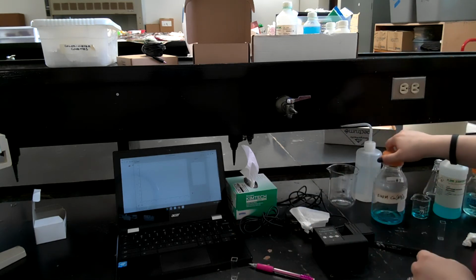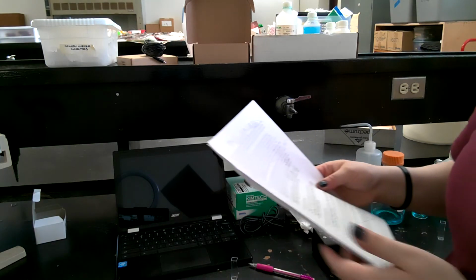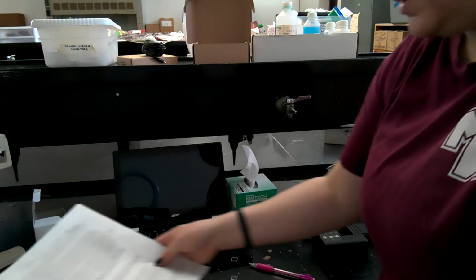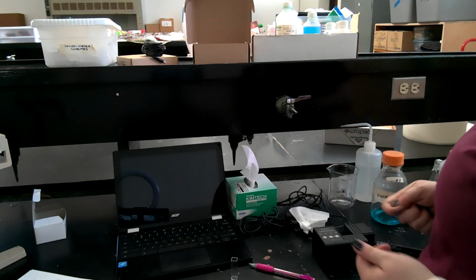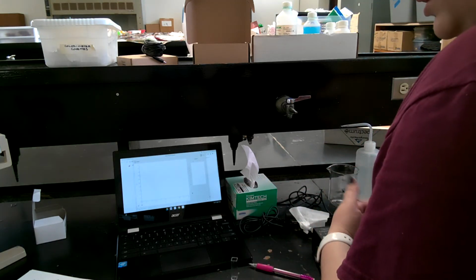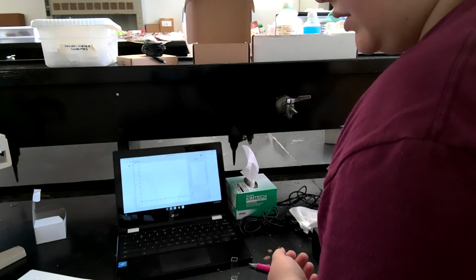According to our lab report, if you're following along with me in the procedure, I am on step 5 of the 3rd page. Step 5 says to empty the water from the blank cuvette, which I've already done, and then using the most dilute of the copper II nitrate standard solutions, rinse the cuvette twice with 1 milliliter amounts, and then fill it 3/4 of the way full.